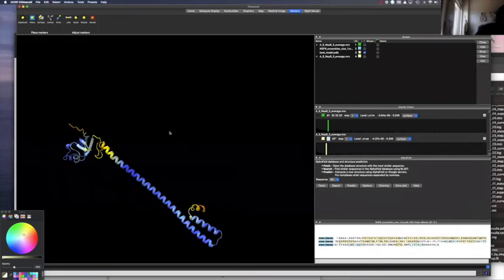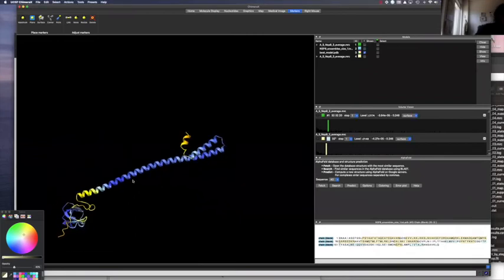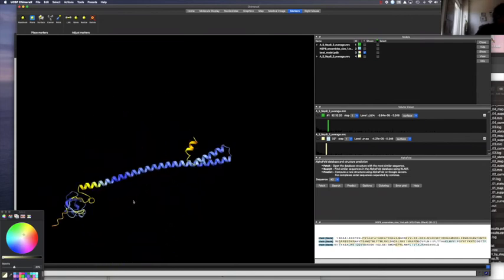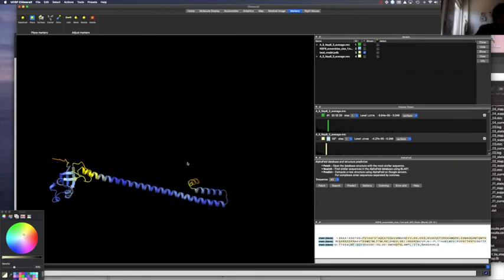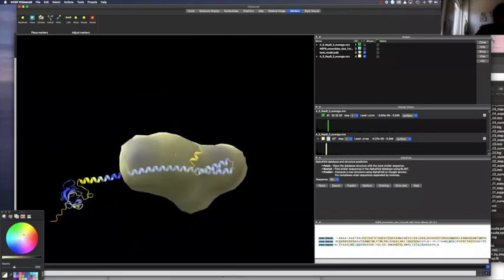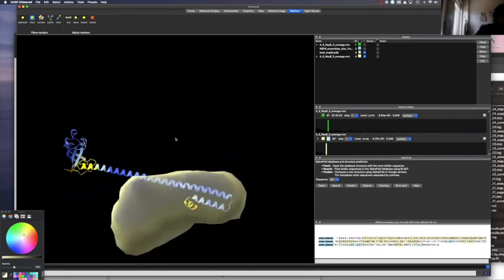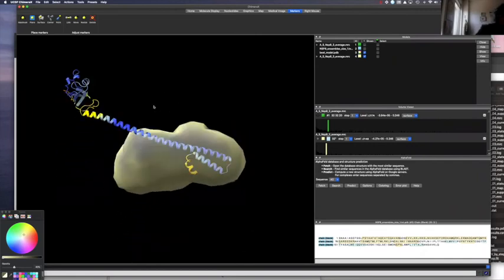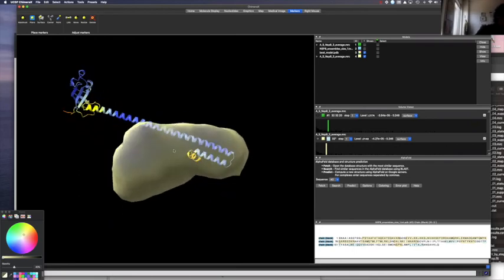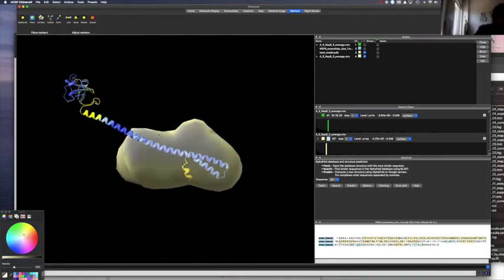where you also have the same visual here. So we have this AlphaFold model, and the problem with AlphaFold is that it is based on a sequence alignment. We can immediately see that the ab initio shape, the radius of gyration and any kind of indicator from the SAXS disagree with AlphaFold. And the only issue in this case is the flexibility and folded-back structure in this coil region.